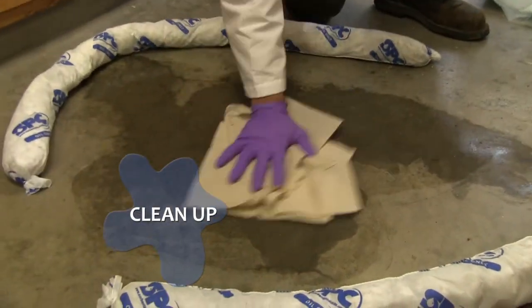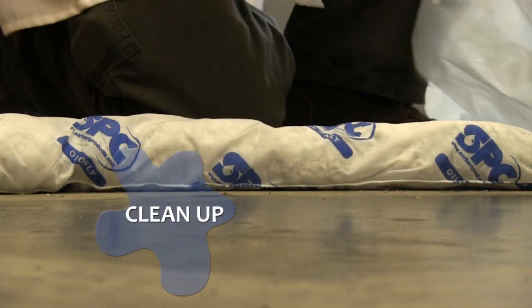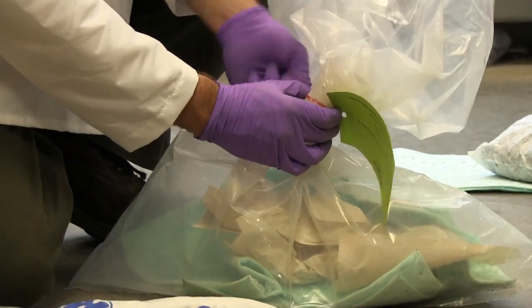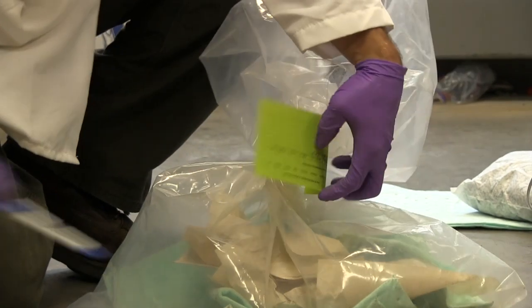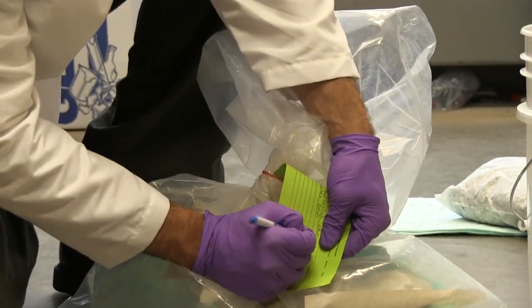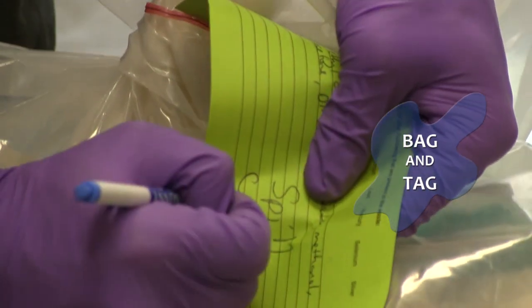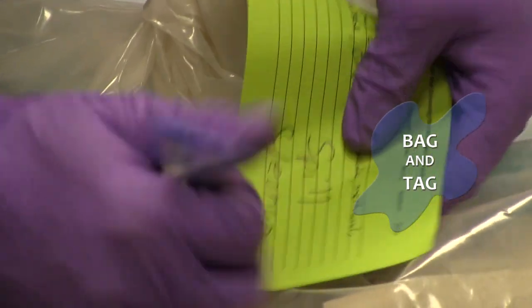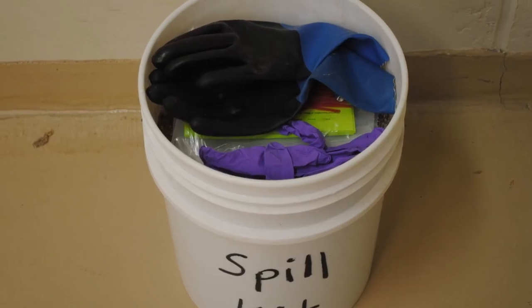Give the spill area a final cleansing with a paper towel and water. Regardless of the spill kit used, attach the green waste label removed from the broken bottle to the bag of cleanup material and label it as spill cleanup material. Once finished, contact your lab supervisor and Environmental Health and Safety as needed. Restock the spill kit for future use.